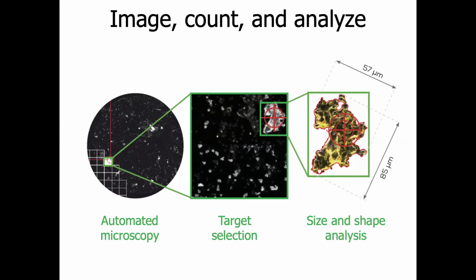But Hound can also be used to count, select, and identify a particle, or hundreds or thousands of particles fully automated. First, it will capture images of the sample area to create a mosaic image of the area where you expect your particles. Usually this area is defined by the diameter of the funnel you used for filtration.